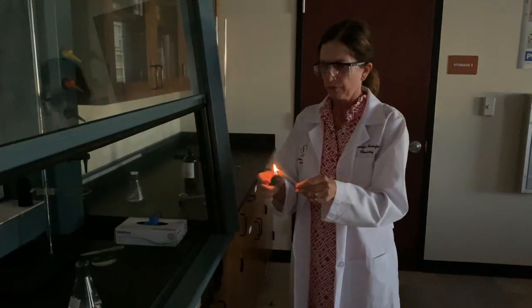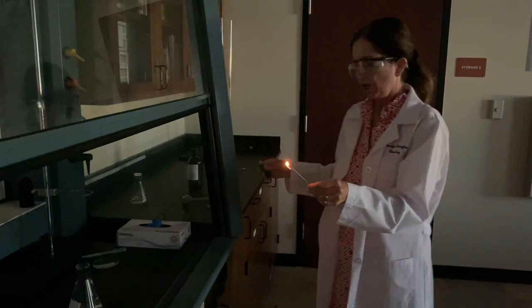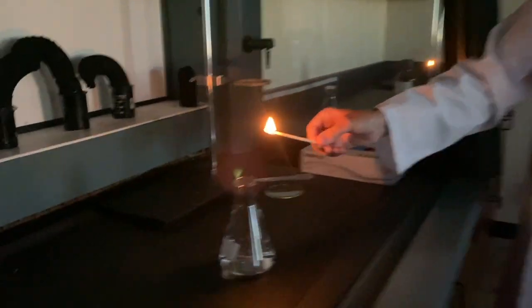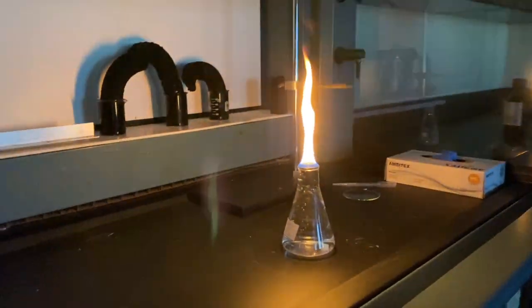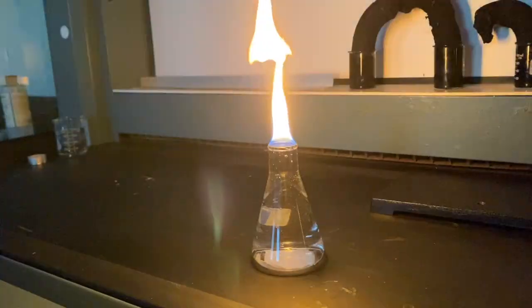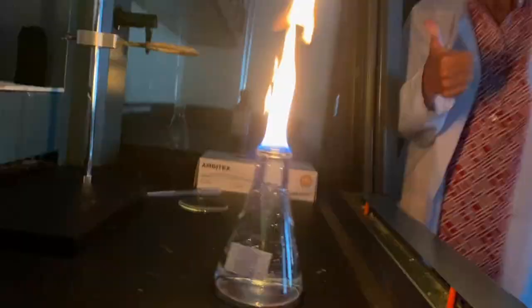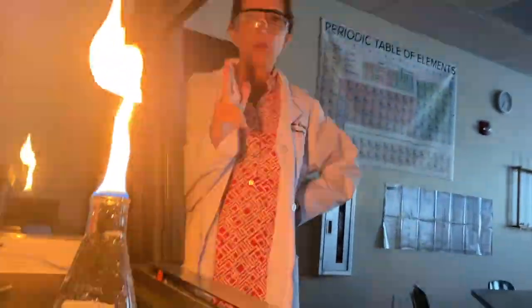All right, let's try this again and see what else we can observe. I'm going to once again try to set fire to the rain. Wow. That's awesome. Now the question I have for you, we ruled out water. So my question is, is it isopropyl alcohol, is it hexane, or is it ethylene dichloride?